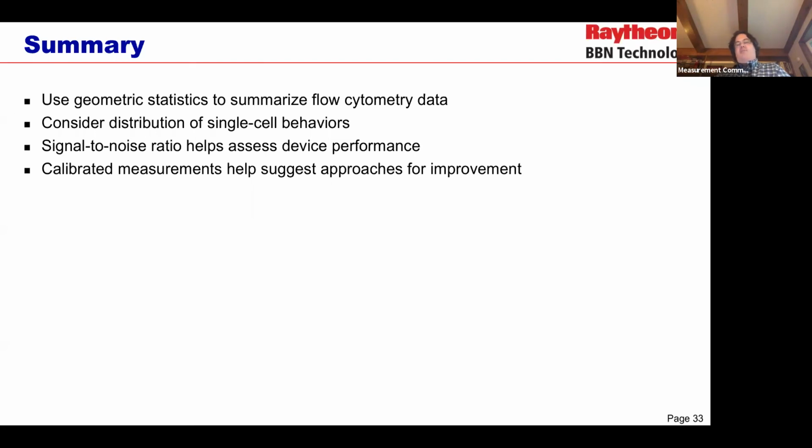People often like to put either the name of the fluorescent dye that they're calibrating towards, like fluorescein or FITC, Texas red. They'll often like to put the laser emission number. So like 561 is a laser that's typically used for measuring red fluorescence. 488, that's a blue laser that's typically used for measuring yellow or green fluorescence. And then the dash A, that would mean area. So dash A, dash H, dash W.